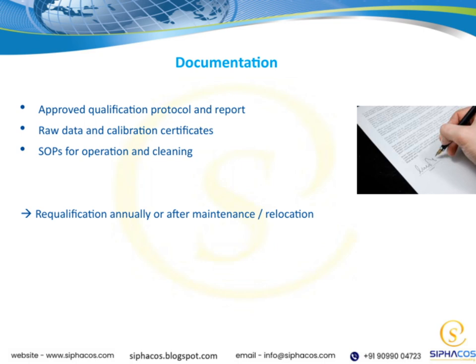maintained. It's important to remember that requalification isn't a one-time event. It should be done annually, and also after any maintenance or relocation of equipment. This ongoing process helps us ensure continued compliance and optimal performance. Keeping these documentation practices up to date not only supports regulatory adherence, but also strengthens our overall quality management system.